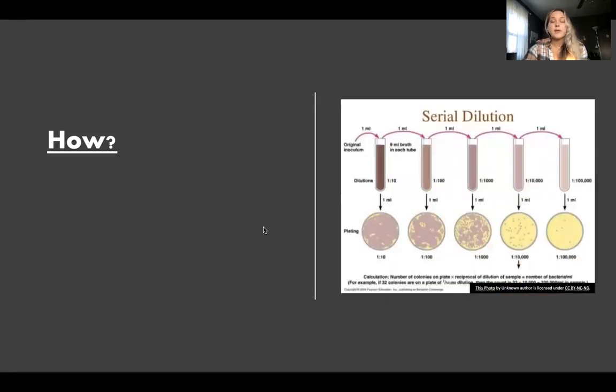Now I'm going to tell you about how I conducted this research and the steps that I took. First, I gathered a soil sample from my backyard using aseptic technique, and I performed a series of serial dilutions as you can see on the screen.